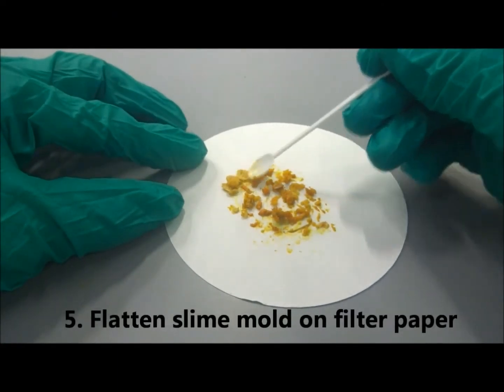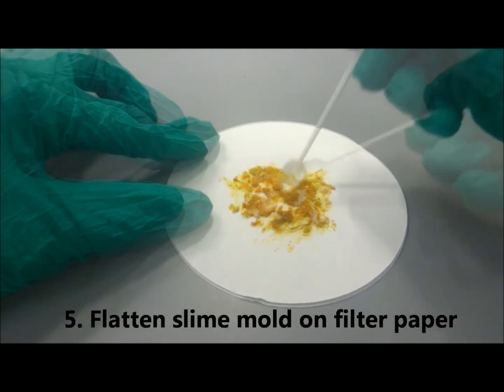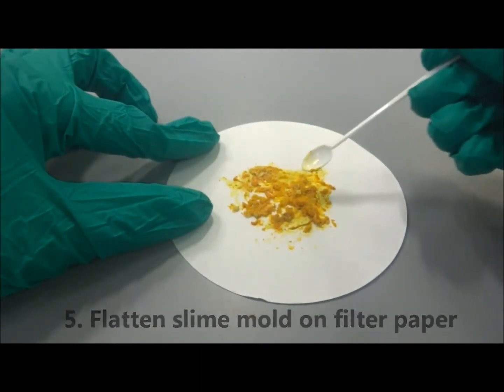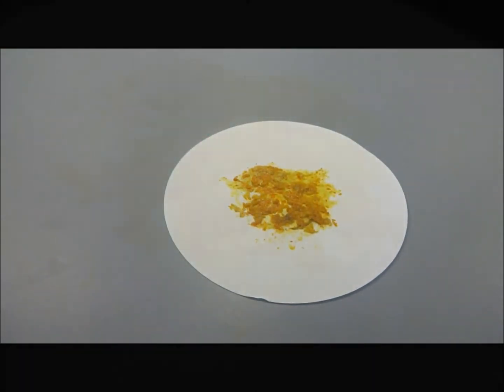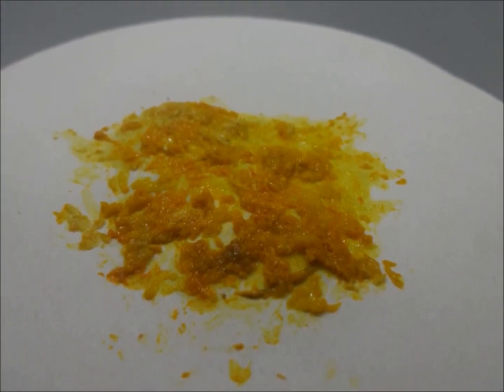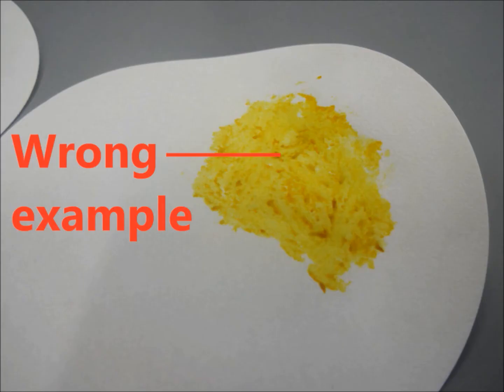Next, use the spatula to slightly flatten the slime mold. The slime mold should appear as a thick brown layer and not a thin yellow layer. Do not smear the slime mold into a thin layer, as the slime mold will not revive when it is rehydrated.